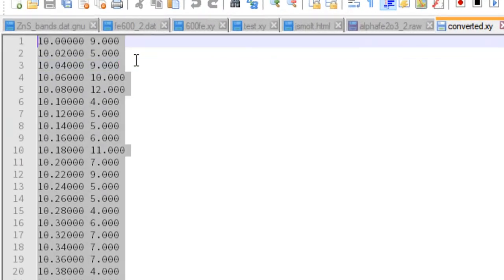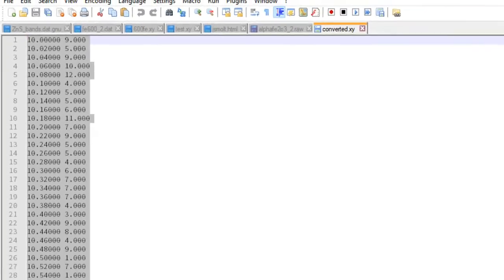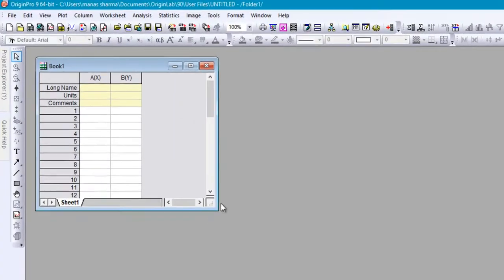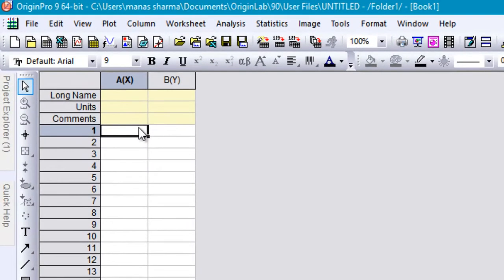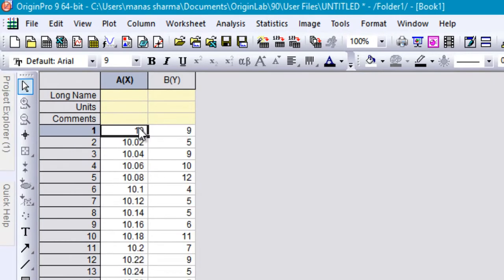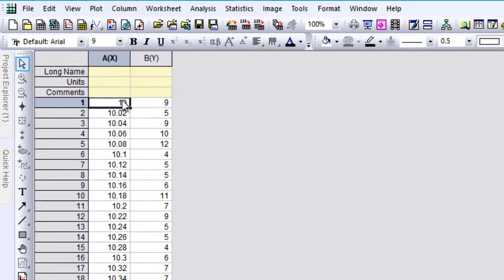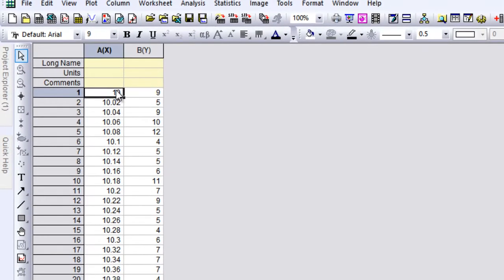Just go ahead and select both of these two columns, then open Origin and paste them into a worksheet by pressing Ctrl+V.